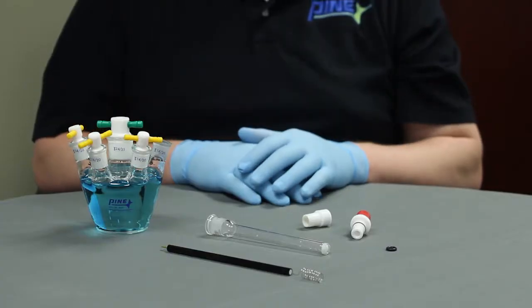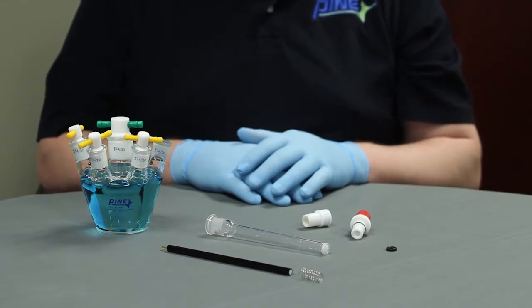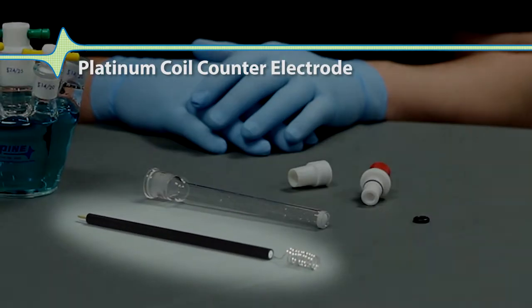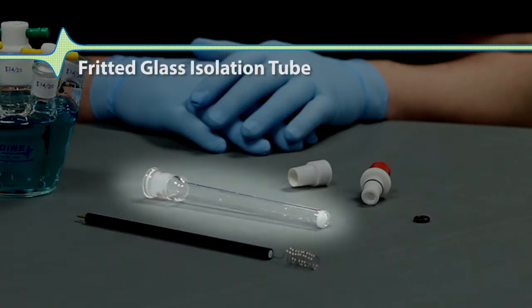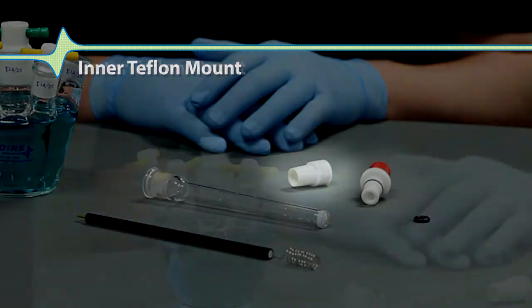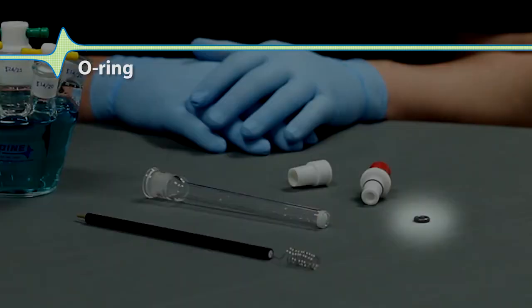The standard size platinum counter electrode consists of the following pieces: the platinum coil counter electrode, the fritted glass isolation tube, the inner Teflon mount, the outer Teflon mount, and an O-ring.